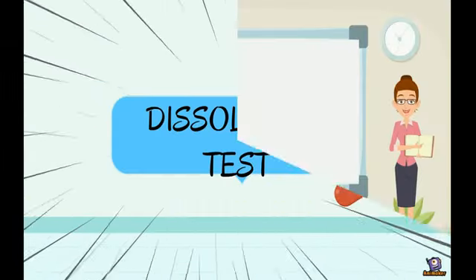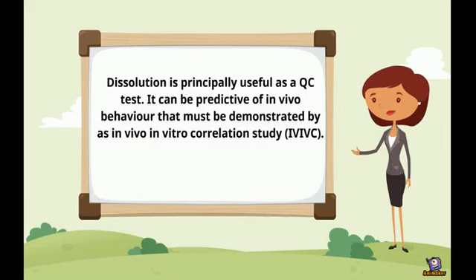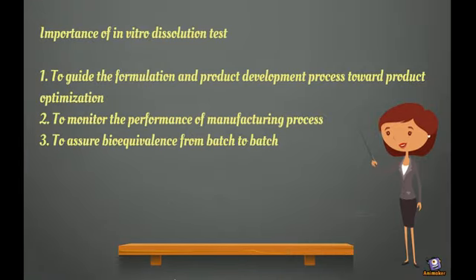Dissolution test. Dissolution testing is required for all solid oral pharmacopoeia dosage forms in which absorption of drug is necessary for the product to exert the desired therapeutic effect. Dissolution is principally useful as a QC test. It can be predictive of in vivo behavior, which must be demonstrated by IVIVC. The importance of the in vitro dissolution test is to guide the formulation and product development process towards product optimization, to monitor the performance of the manufacturing process, and to assure bioequivalence from batch to batch.